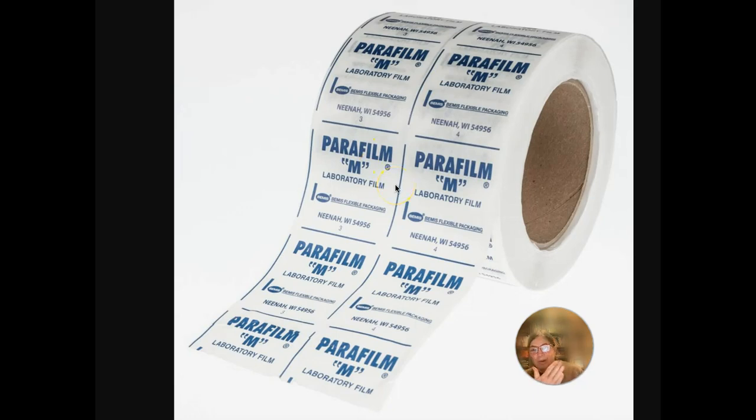And this is the super cool stuff called parafilm that you can use to fix the leak. It stretches, it feels like wax, and you can wrap it around all the joints and make sure nothing is leaking. So that's the main thing you want to be worried about.